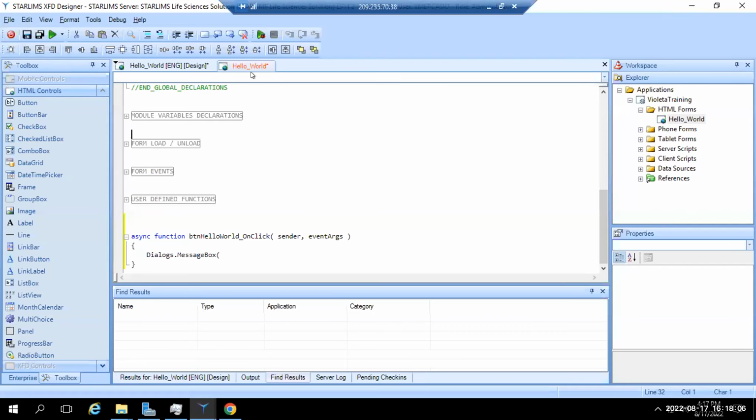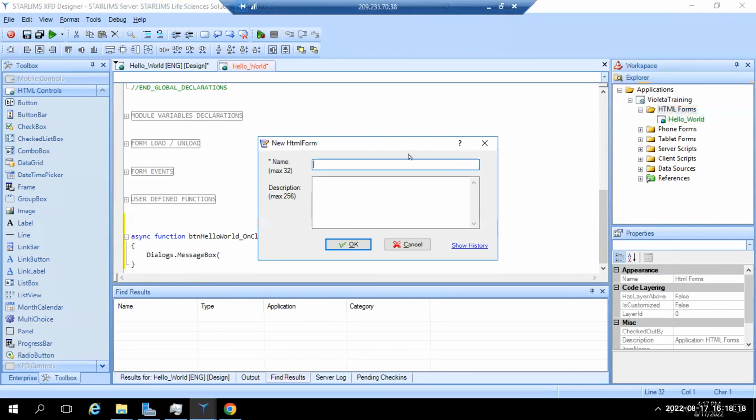Okay, let me see. The next one is going to be a little bit more interesting. I don't know if we can do it in 15 minutes, but we can try. Okay, you see it? There, yes. Okay, so let me annotate here, do another one, another form, right click, say add, call it remote add.